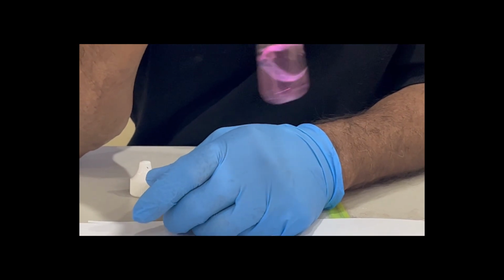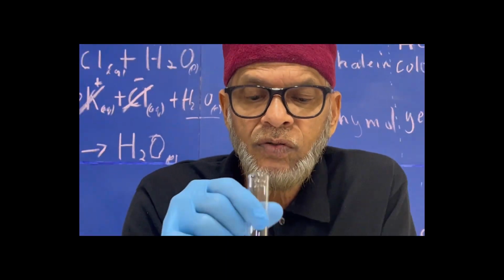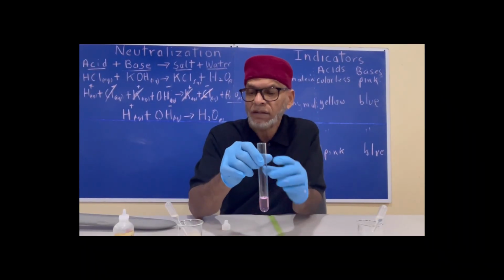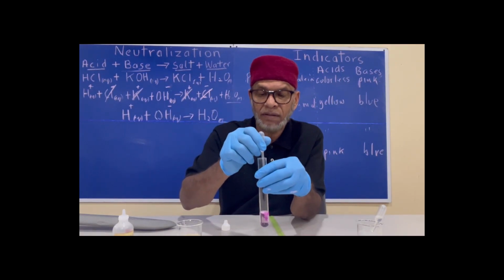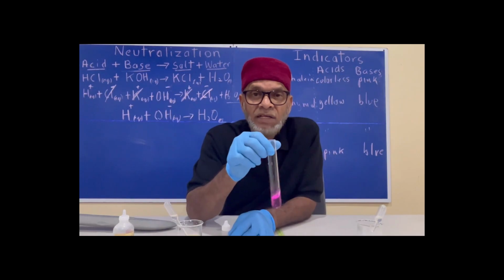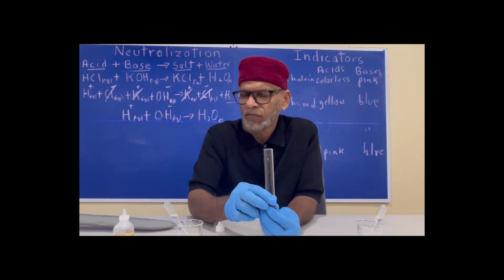That indicates to us that, you know what, all the acid has just been neutralized and now we have a drop or so more of the base that's left in excess. This solution will stay pink. Maybe you drop 1 drop more to get a nice deep pink color. All right. So it stays. That means neutralization has just happened, but we have a slight excess of the base.